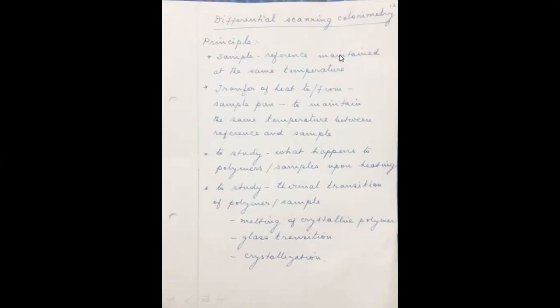Some crystallization will take place at an elevated temperature, and an excess amount of heat energy has to be supplied for the crystallization. So on such occasions, when you keep a substance which is to be crystallized and the other substance as the reference together, an additional supply of heat energy is required to the sample pan to initiate the crystallization and for its proceeding. Such additional supply of heat energy for the crystallization can be followed using the differential scanning calorimetry.